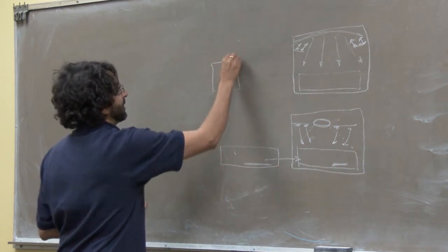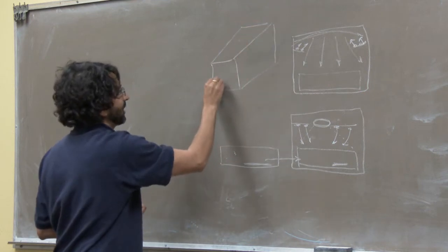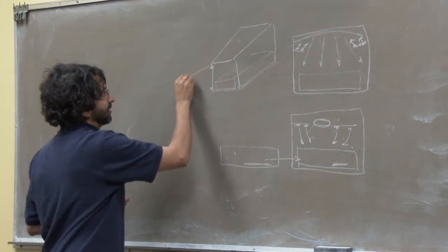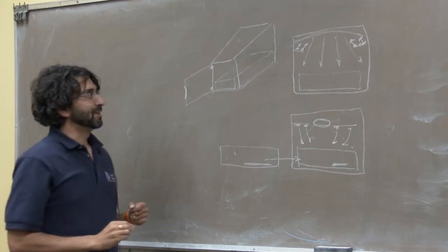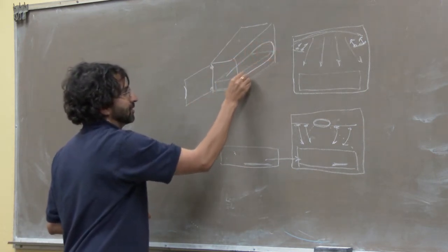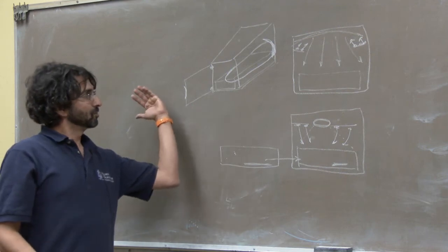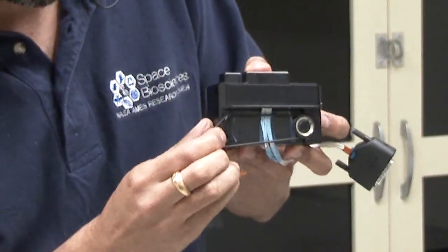I'm going to redraw the same thing in 3 dimensions to give you a better idea of what we did. Inside, we have the cassette. And so what we did is install hinges with our door and a little clip there, on the side of which we installed a stiff rubber band that's then fixed at the end, such that if you want to close the unit, you close the door, insert the rubber band, your observation system is shut.